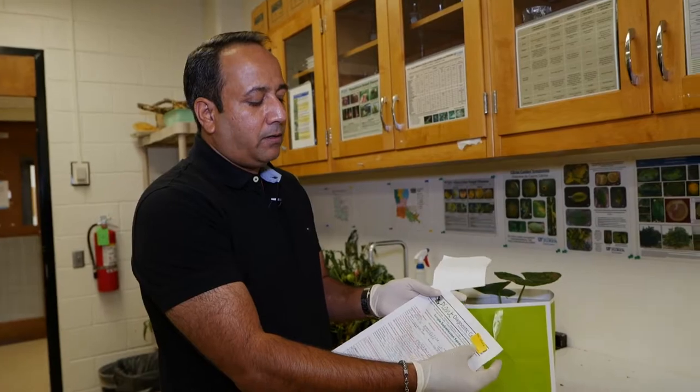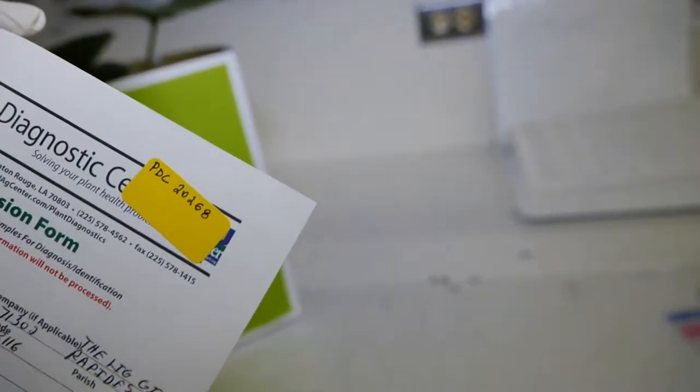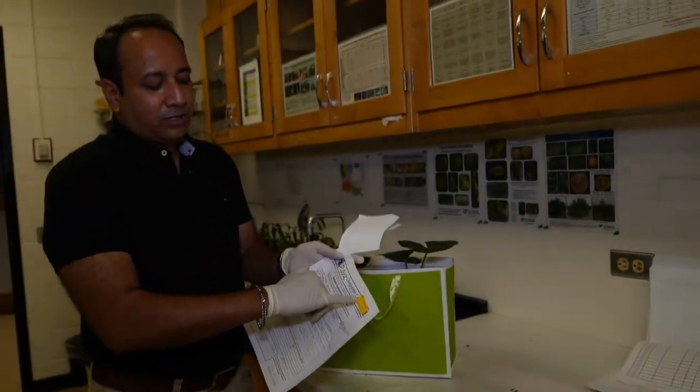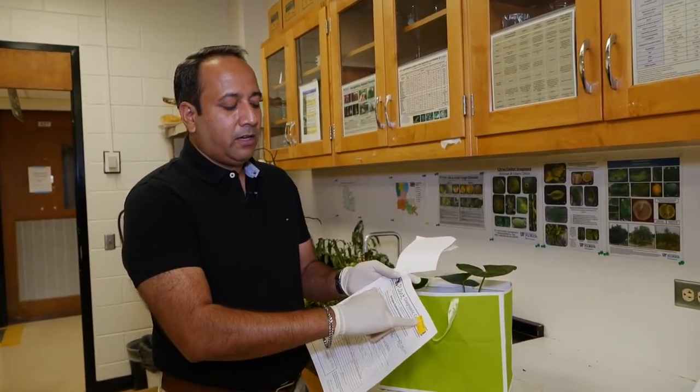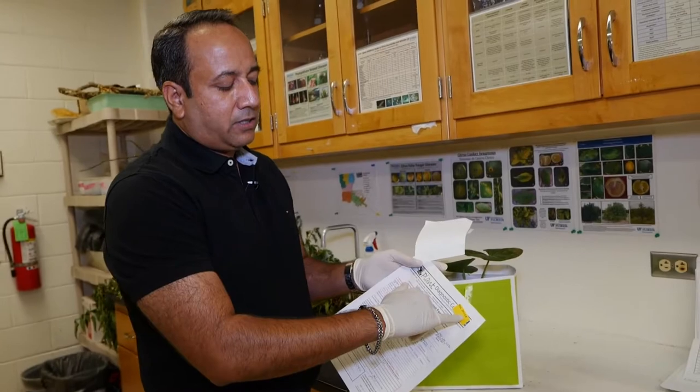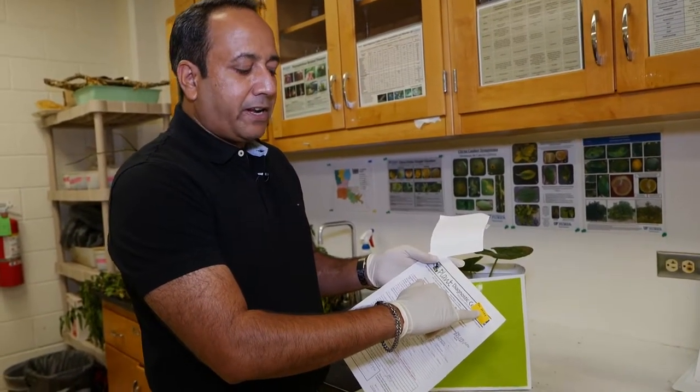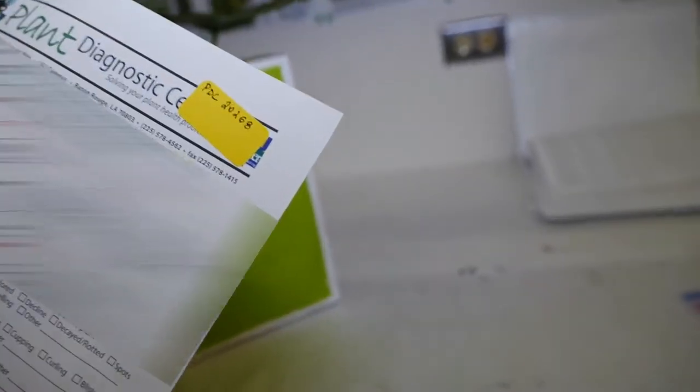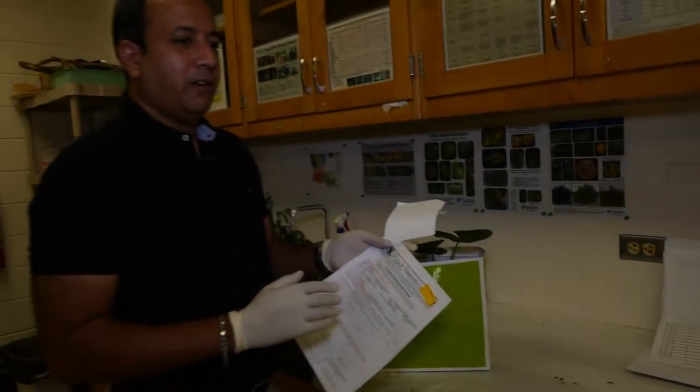When a sample comes in, we log it with a unique number that will stay permanently with this sample for the time period we keep our records. It's a five-digit number—the first two digits are the year, and the last three digits are the sample number. You can see even with COVID-19 we are at 268 samples this year.